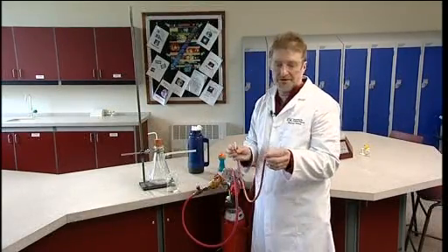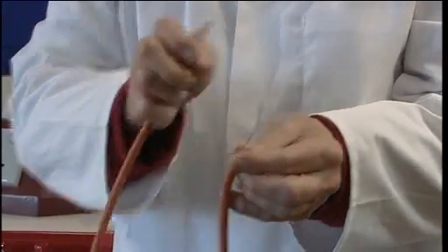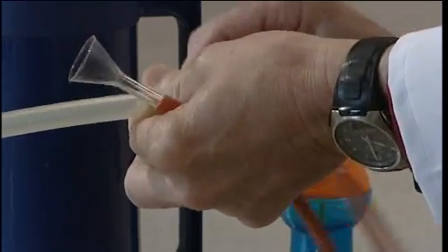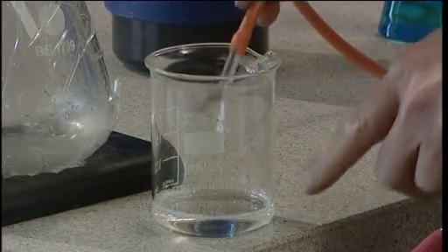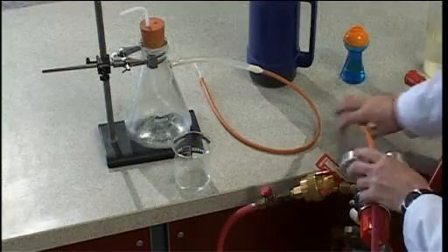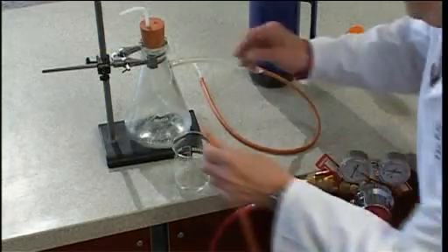The bubbles are blown with a small funnel — it needs to be quite small, no more than about two centimeters in diameter — which we attach to the flask and dip into a bubble mixture. This can be made using 5 cubic centimeters of teapol, 5 cubic centimeters of glycerol, and 40 cubic centimeters of water. Alternatively, use a commercial bubble mix, but they can be variable, so it's worth experimenting beforehand to make sure it can produce robust bubbles with these gases.